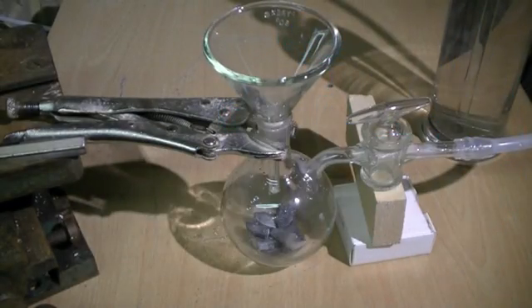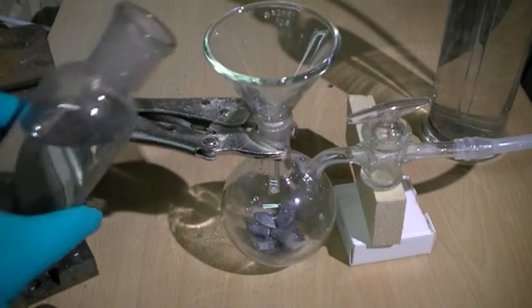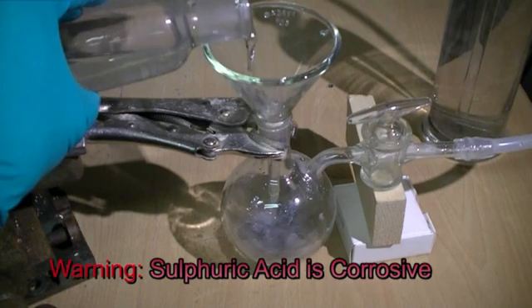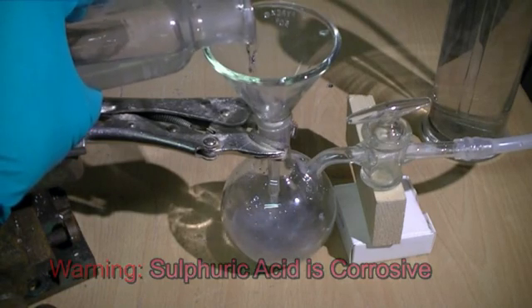Now using a small glass funnel we add some sulfuric acid to our reaction vessel. The sulfuric acid was harvested from a lead acid battery by filtering the electrolyte.